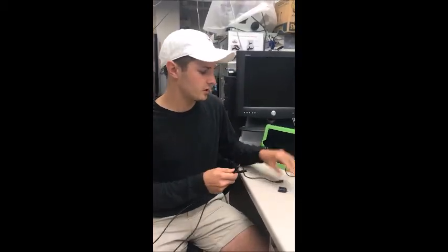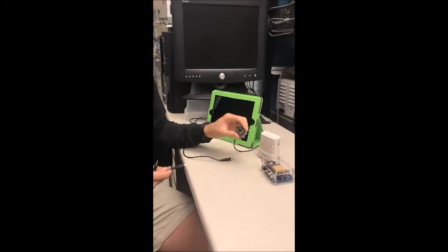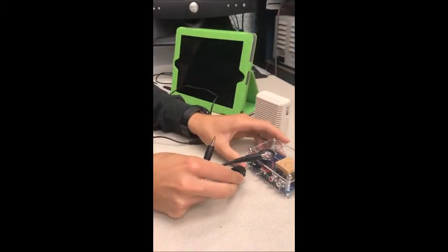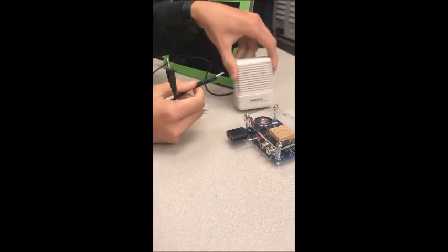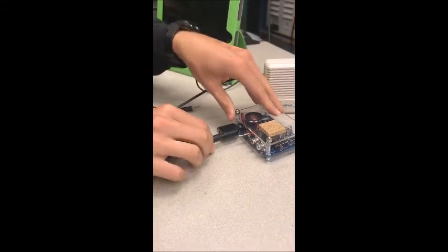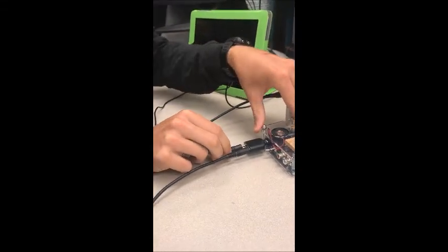In this experiment, you can use both the audio and the visual component by using the splitter. This is a Radio Shack splitter, but I'm sure you can order it through Amazon or Backyard Brains, and you just plug it in like this, and then this will go to the audio amplifier in the input. You plug it in one side, and then the visual connected to the iPad on the other side, and you're ready to go.